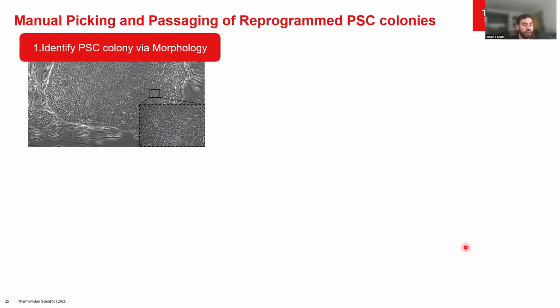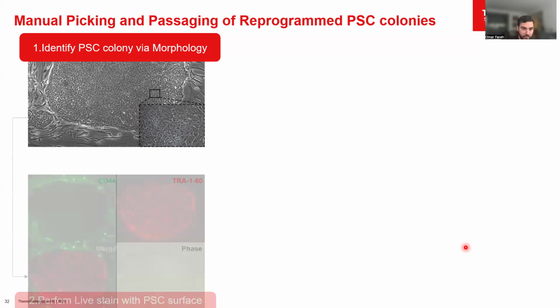We can do that with a marker, but there are also some really nifty tools and microscopes that have little circles that go onto the actual objective and can be used to stamp the bottom of the plate as well as you're working your way through.